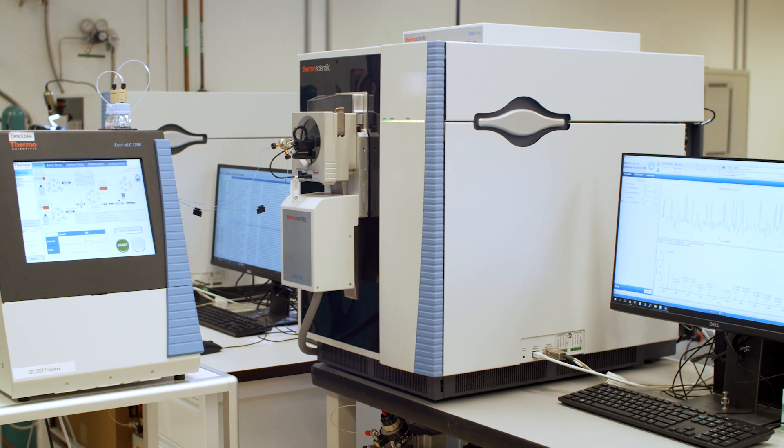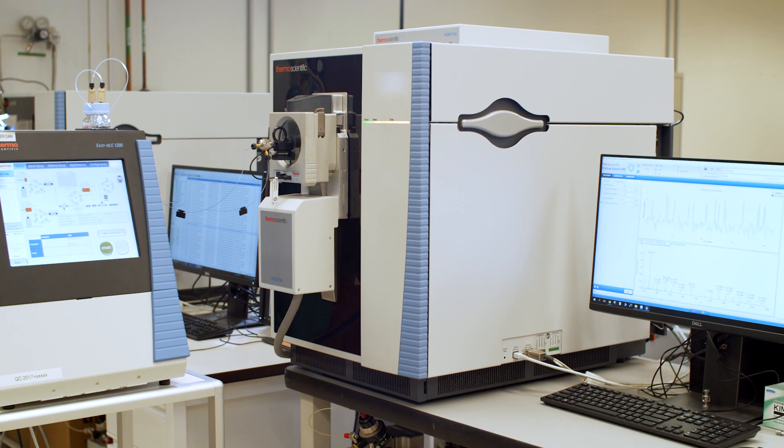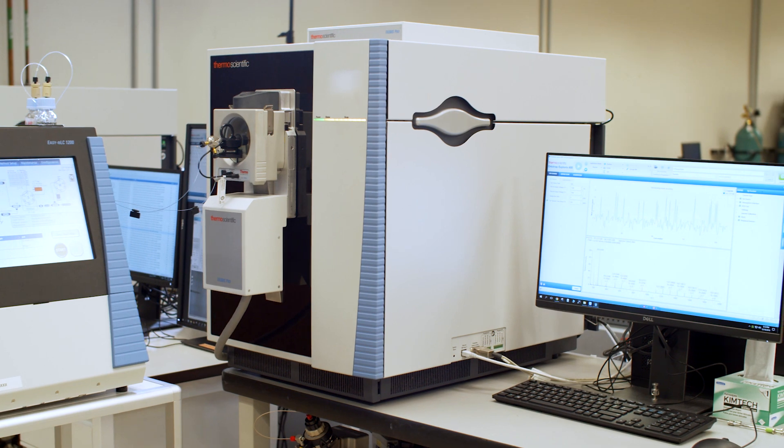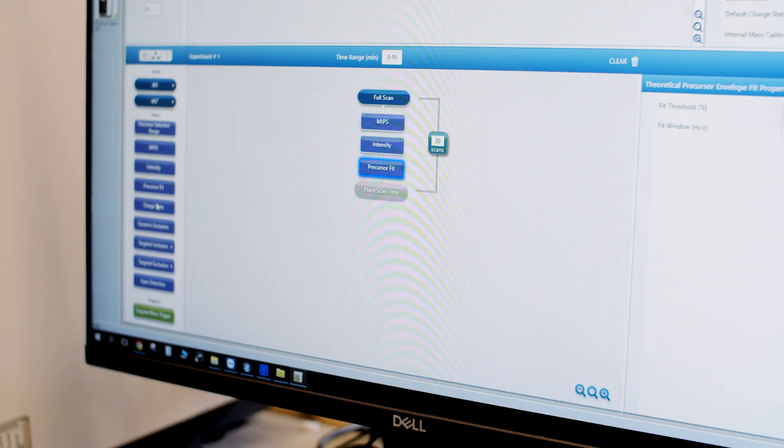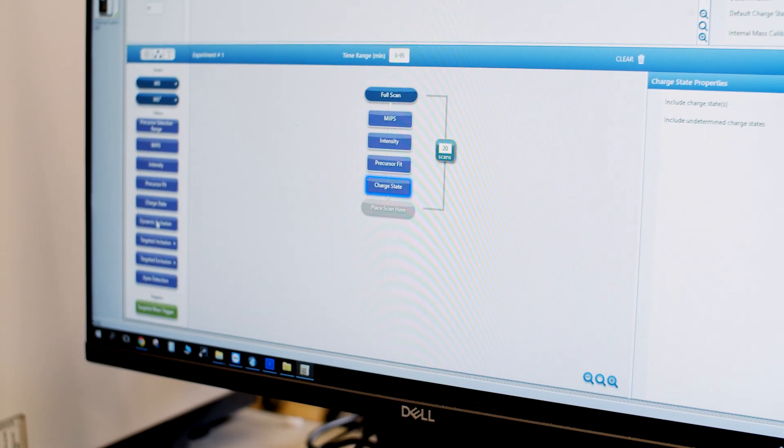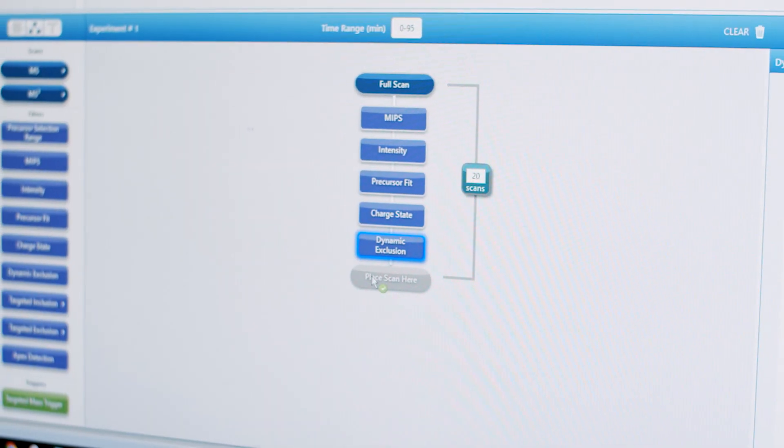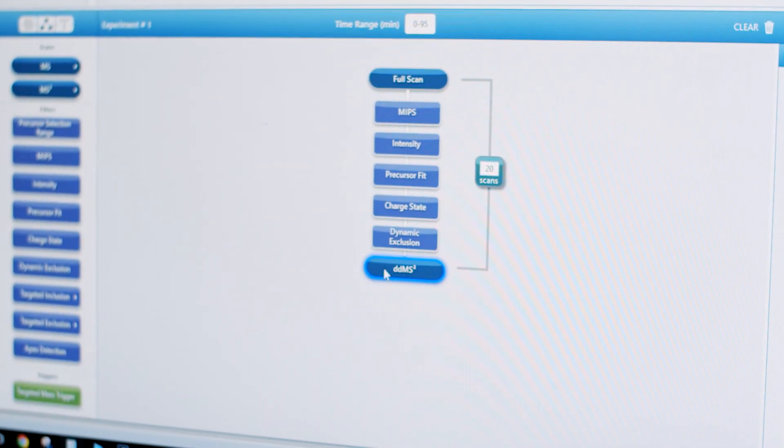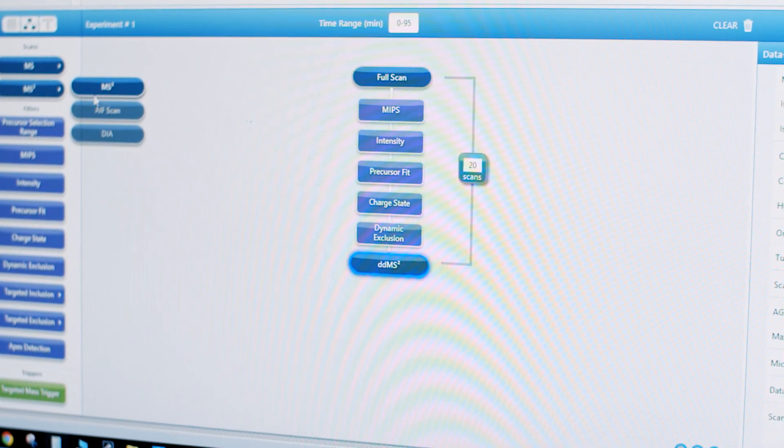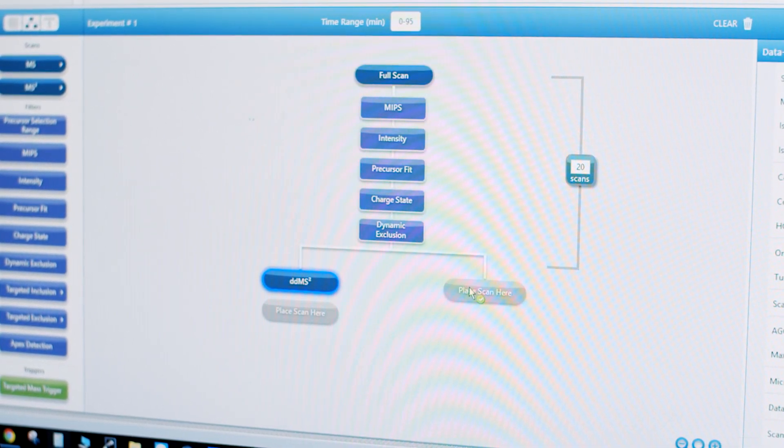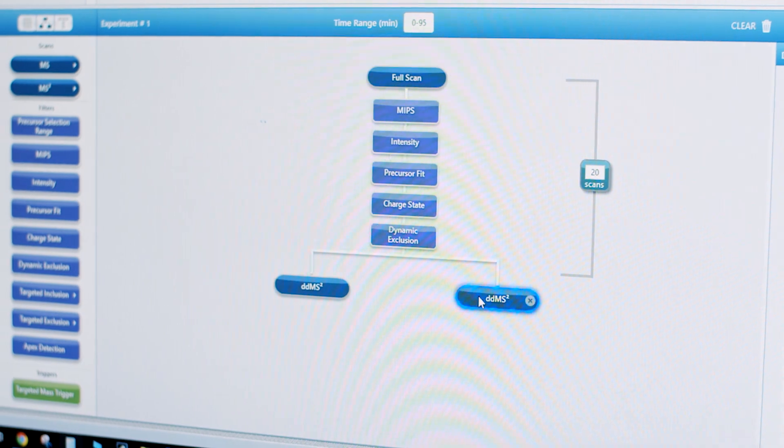With the introduction of the Thermo Scientific Orbitrap Exploris 480 Mass Spectrometer, we offer you game-changing performance with an unparalleled user experience. This out-of-the-box solution gives you access to a vast range of pre-set experiments and applications, customizable with simple drag-and-drop modifications to address your needs as a result of the next-generation unified architecture we've deployed across all of our latest platforms.